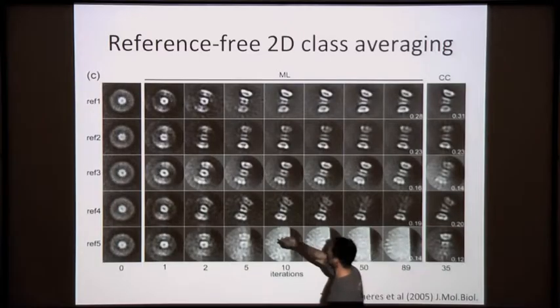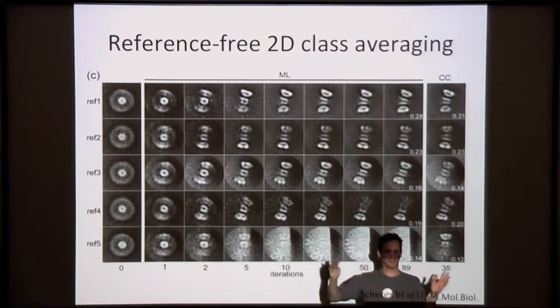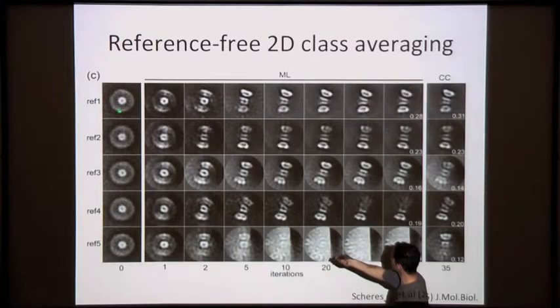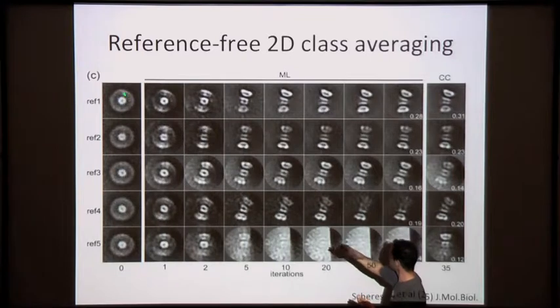And because these particles are actually a bit elongated, they're decamers, if you don't align them, then you'll get something like is shown here, which is more like a circular-like feature. Okay? Now, there is no biological information whatsoever apart from the radial distribution of density in this particle in these initial references, and the differences between them are just based on the random subsets. So there's no real differences between them. It's just different random instances.